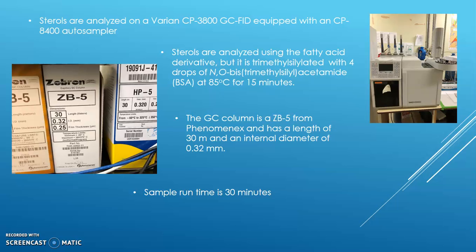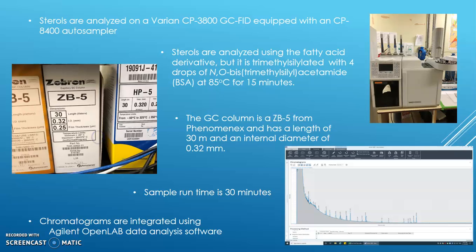Again, this machine has an autosampler, so it is able to be run 24 hours a day, so you can process about 40 samples in a 24-hour period. Chromatograms are integrated using the OpenLab data software.